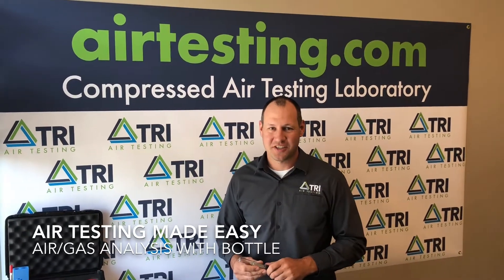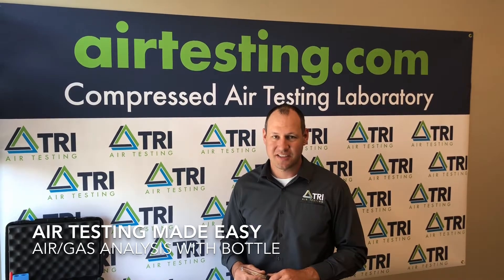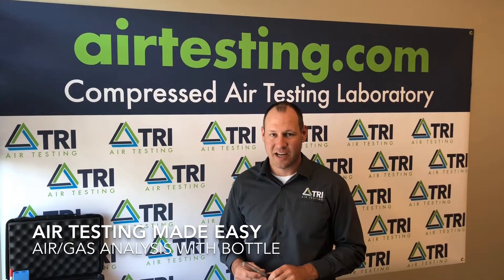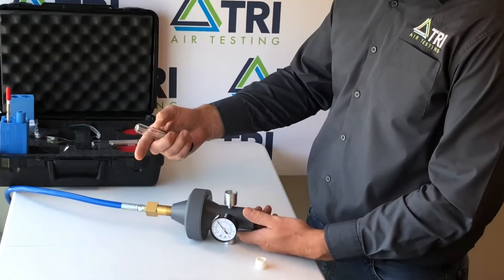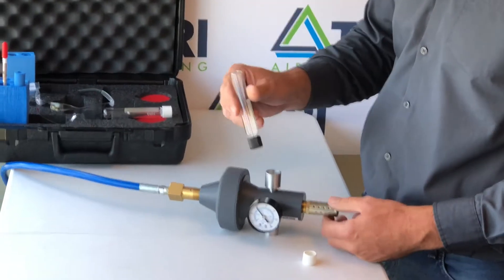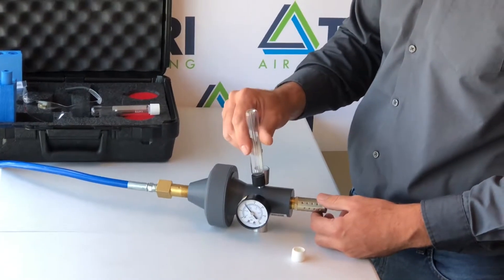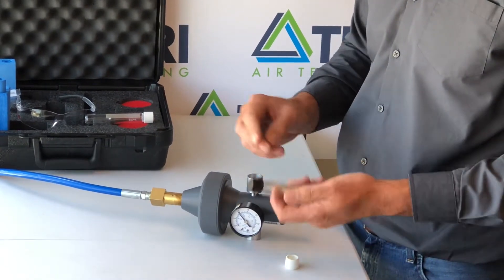Hey everybody, welcome to today's edition of Air Testing Made Easy. I'm James Scherer with TRI Air Testing, and today we're going to discuss collecting an air gas sample into a Cymex bottle. With the Champion 35 attached to your air system and pressure obtained on our gauge, you'll insert the bottle into the bottle fitting to collect your sample. I'll demonstrate it for you now.